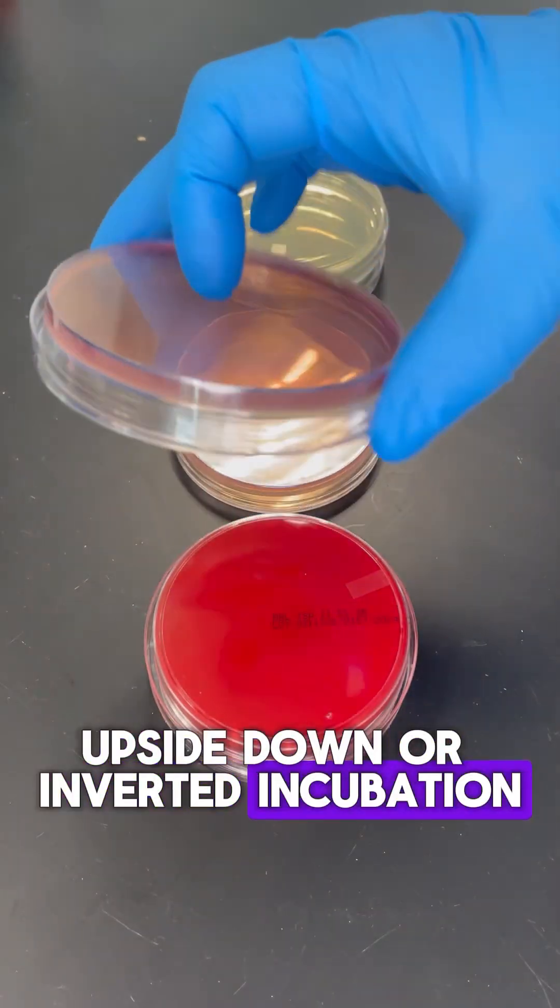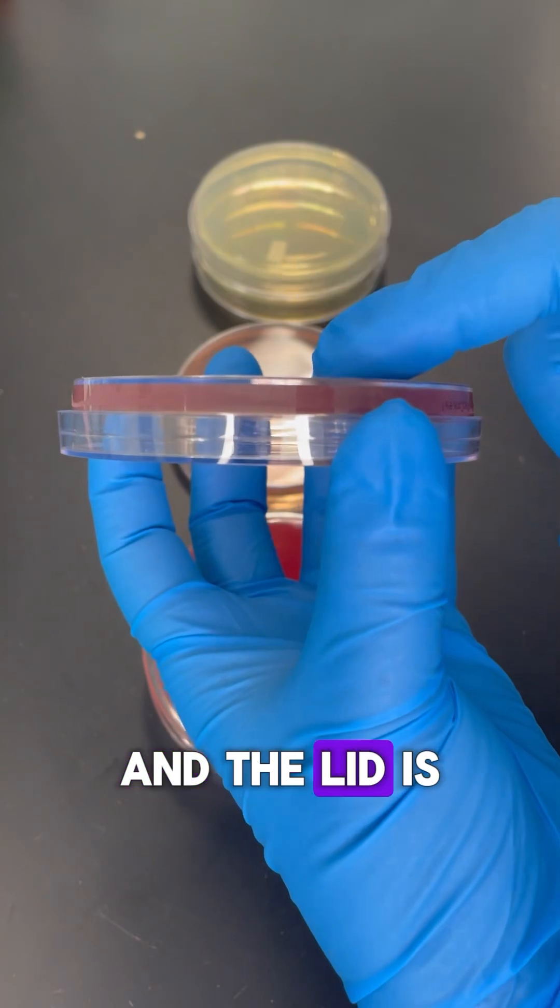Upside down or inverted incubation is when the agar side of the plate is up and the lid is on the bottom. But why? Well, there are a few reasons.